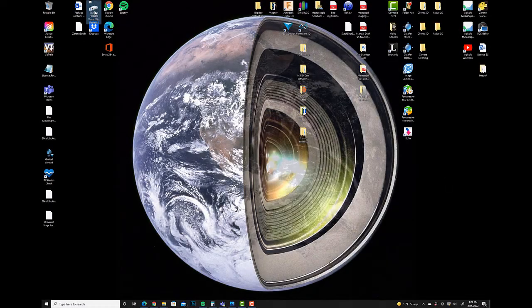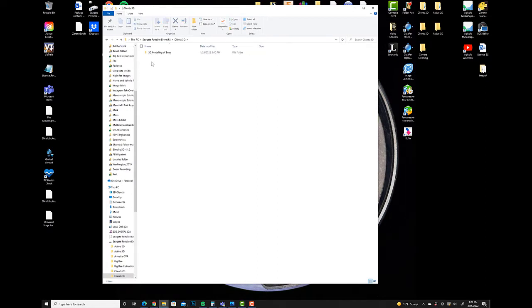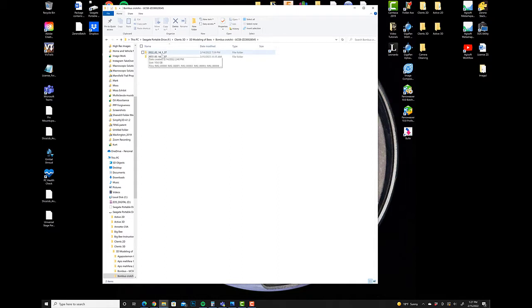Alright, so now what we're going to do is navigate to the folder where our images had been stored. I had already done some minor organization on the two 240-degree rounds that I had done around the specimen. So I'll show you what I did now. We're going to navigate to the specimen. When I did my first set of images, all I did was put -1 and then -37. That's just because I knew I was going to capture another round of images. So to separate out the first round of images from the second, now I have two isolated folders.